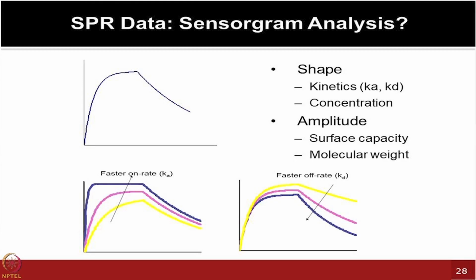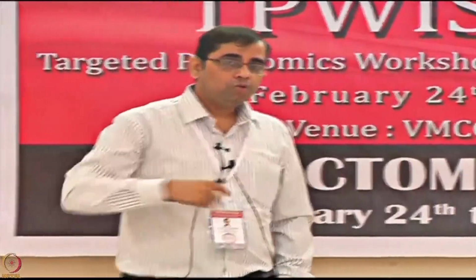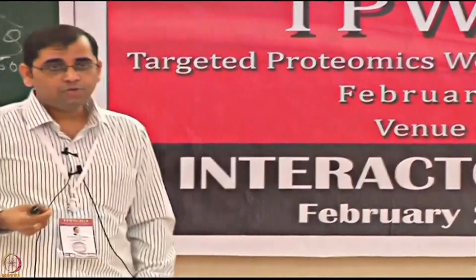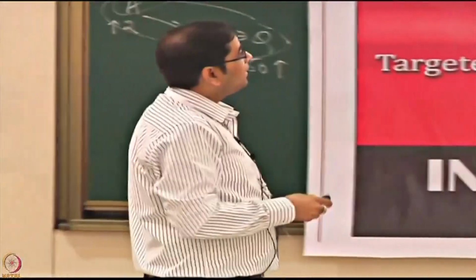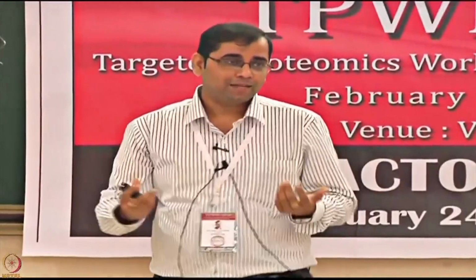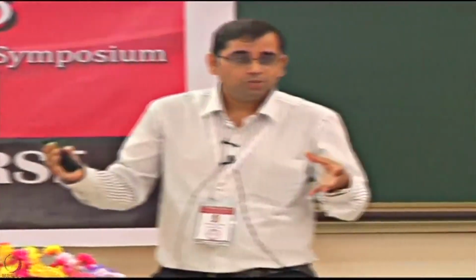So therefore these kinds of curves are very crucial as you are watching. There are many companies who work with us, who do the testing in our labs, in our facility, who are looking at their biosimilar products and some of these kinds of testing. We can see from their experiments that just looking at the shapes of these sensorgram curves can make them feel excited or not so excited, because immediately it tells them whether it is working or not working. So all of this is just visual.